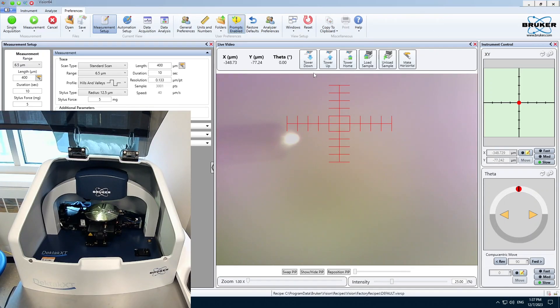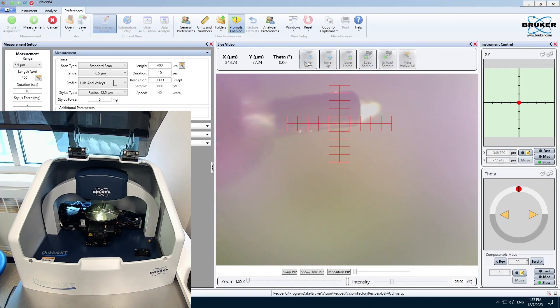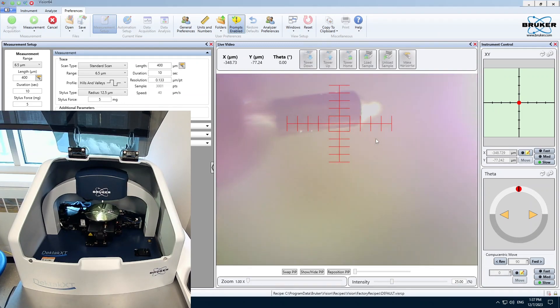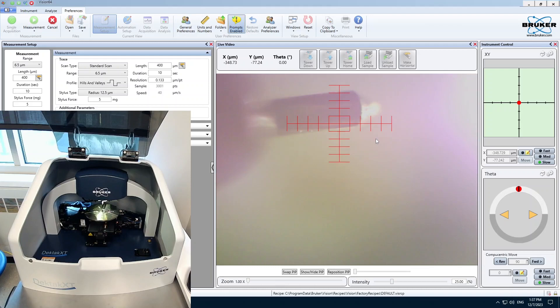Now you want to hit Tower Down, and the Stylus will come into contact with your sample and then retract.